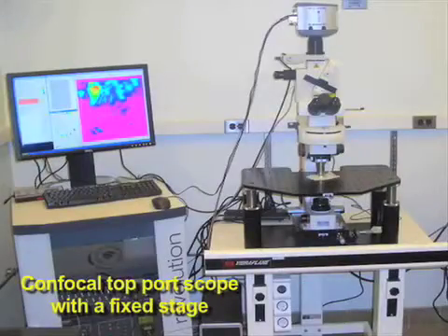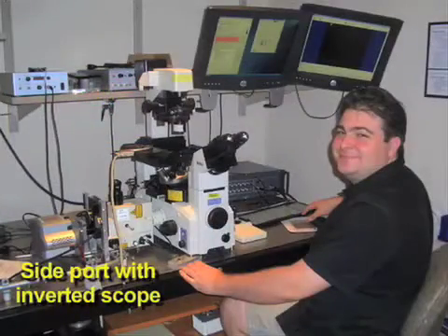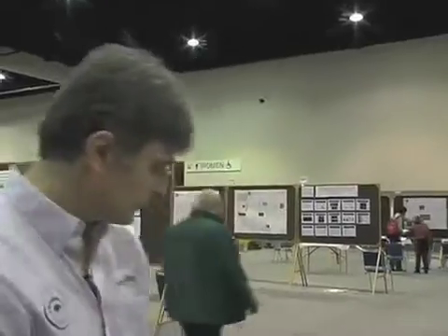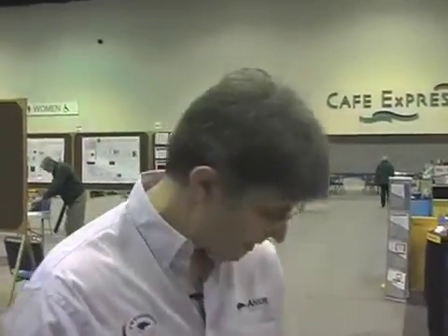This can essentially go with any microscope system. We quite commonly supply the system from the C-mount outwards, and the customer deals with the microscope company. It doesn't only work on inverted microscopes on side ports — you can also put it on upright microscopes such as those used in physiology, and on bottom ports as well. It gives a lot of flexibility, and the beauty of this confocal system is it only takes up one C port of the microscope, allowing you the freedom to bring in other illumination techniques through other ports. It's all controlled through a high-powered PC with a RAID controller sitting under the table here, and the heart of the system is in our laser combiner cabinet, which we sometimes call the revolution fridge.